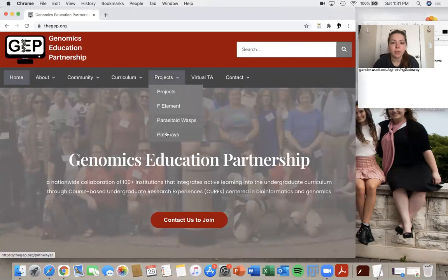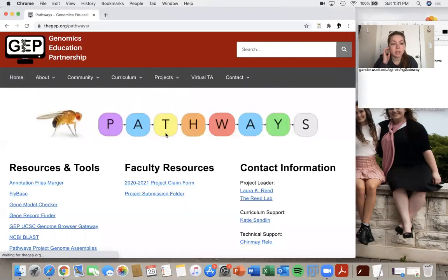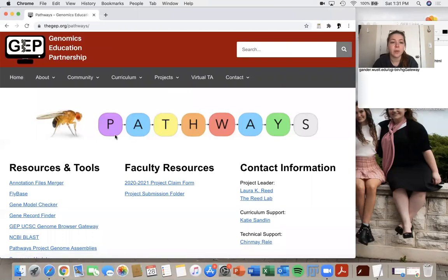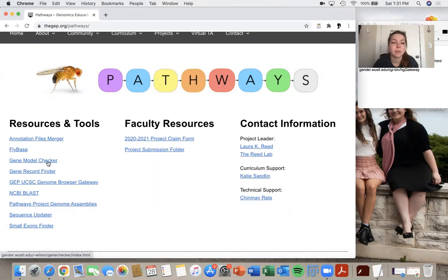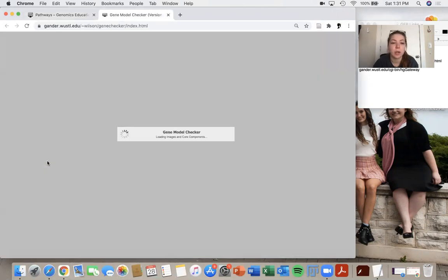We're going to go to projects. I'm just going to choose pathways and under the pathways project you can see we have all of these resources over here. So the first one that we want is the Gene Model Checker because that's what I'm going to be showing you how to use.